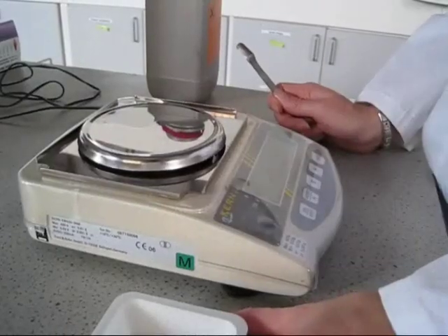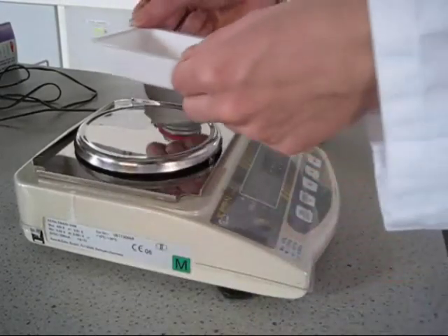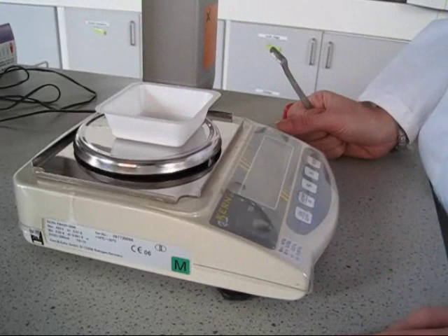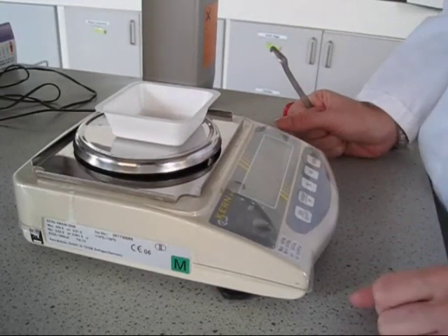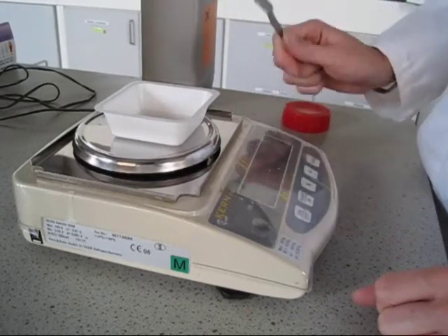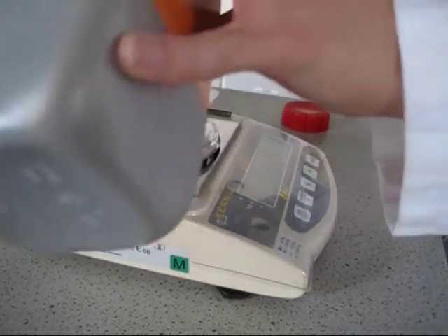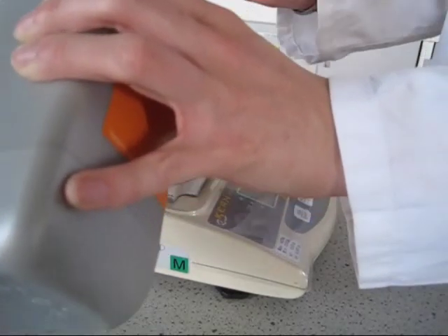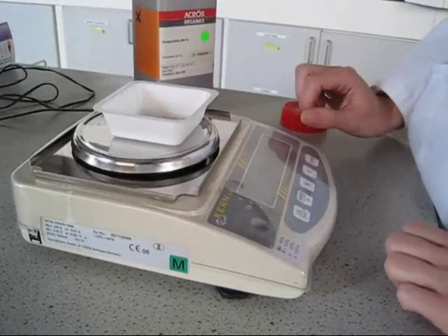In order to weigh something accurately on a top pan balance, first of all take your weighing boat, place it on the balance, press tare. This will minus the weight of the weighing boat. You can then weigh your solid in the weighing boat and you have your accurate weight.